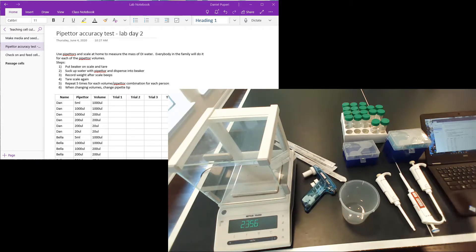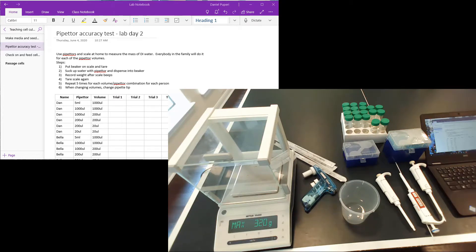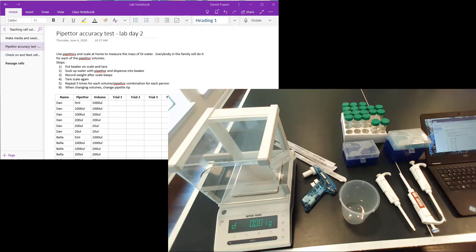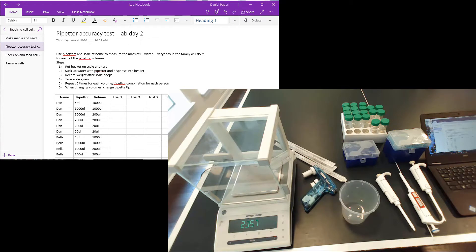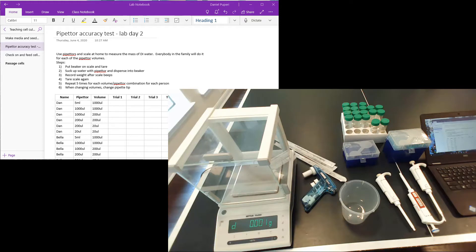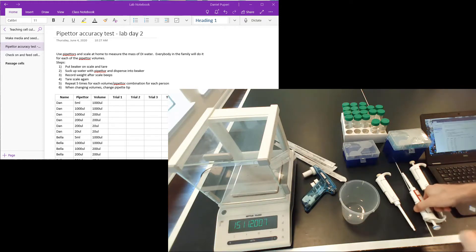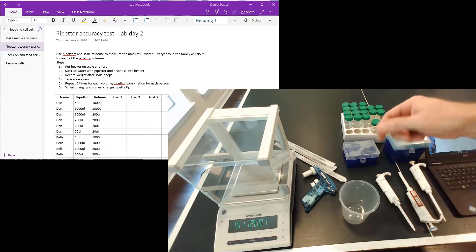I have my lab notebook all set up and ready. Instead of it just being me, I'm going to do me and my kids and collect data from them for the pipetters. I already have the lab notebook set up to write down all the data. So without further ado, we can get started.